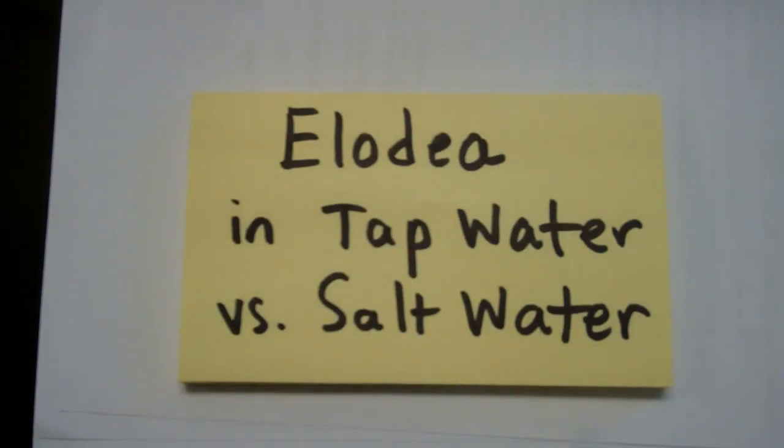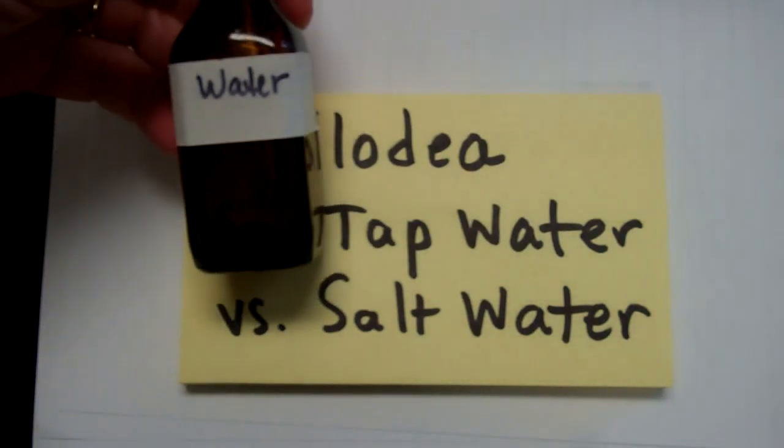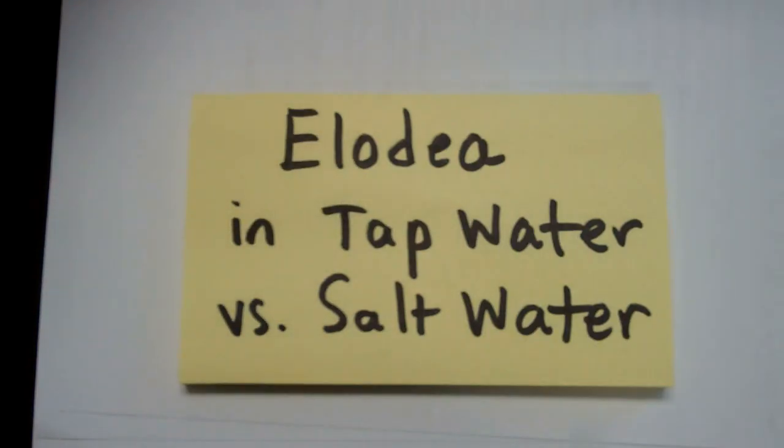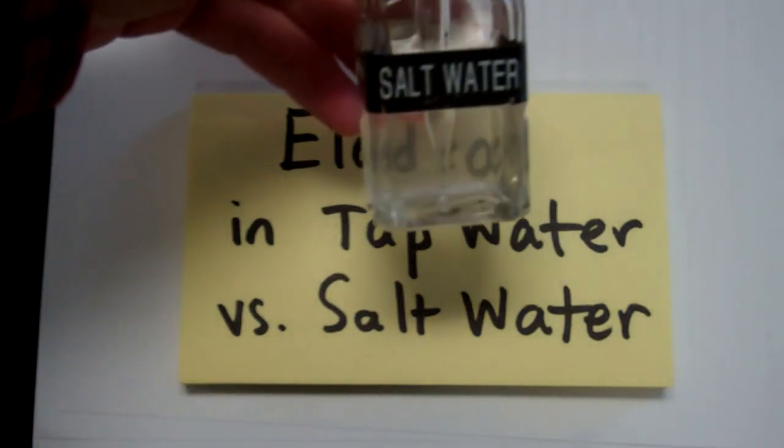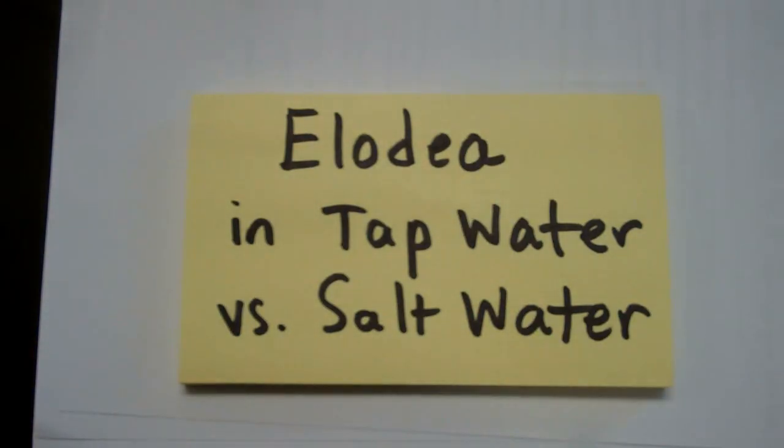Today we're looking at Elodea, which is a water plant, and we're going to put it in tap water, and we're also going to put it under some salt water and see the difference. We're studying about water moving in and out of cells, so this is a great lab to see this in action.